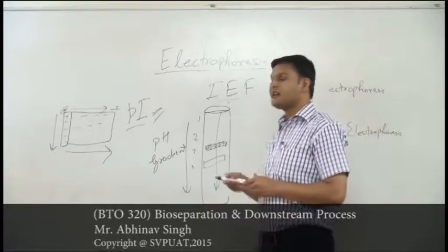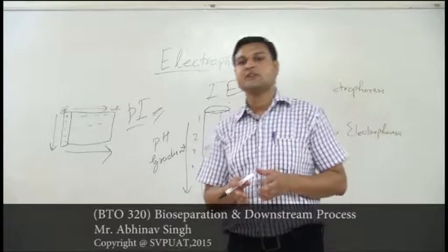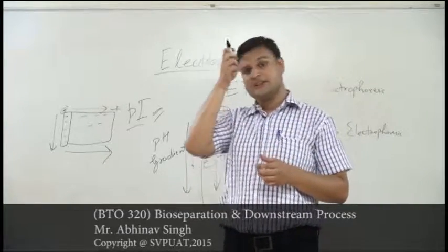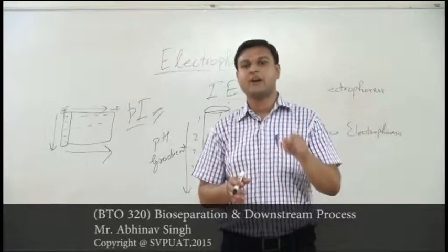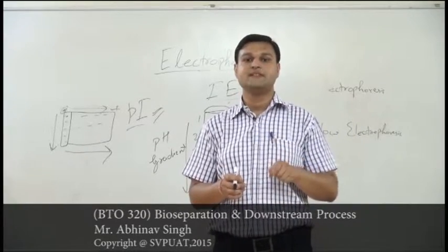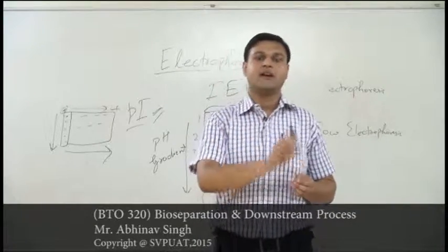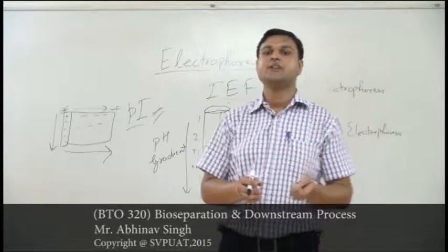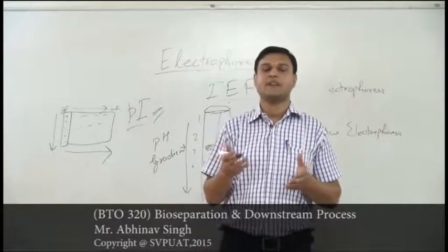For nucleic acids we directly use the gel electrophoresis system, in which a horizontal gel is cast. We use a vessel in which the gel is first melted and then settled down. We put in a comb, which prepares the wells, and remove the comb after the gel solidifies. We add our product to be separated, a solution containing nucleic acids, which are separated based on their size, charge, shape, etc.